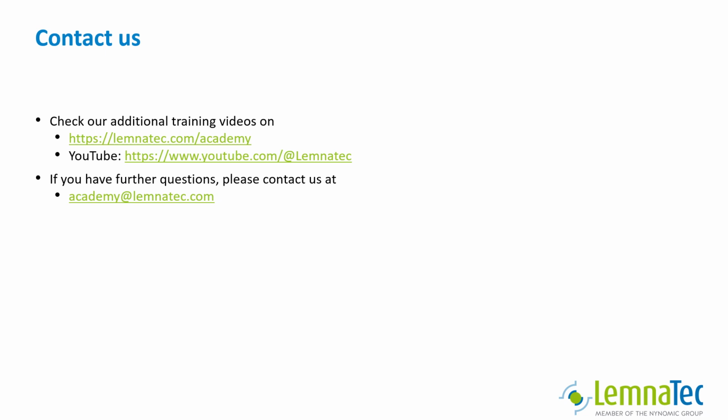That was my introduction to the LemnaTec label tool. I hope you will find it now easier to label images to create your machine learning models. See you in another video.